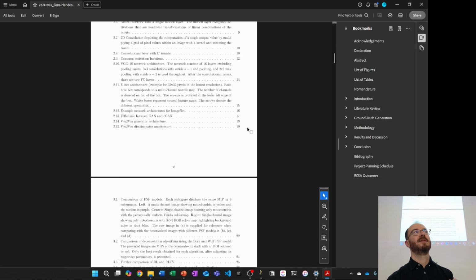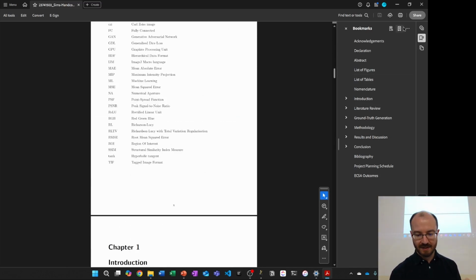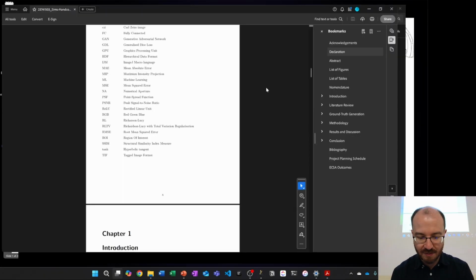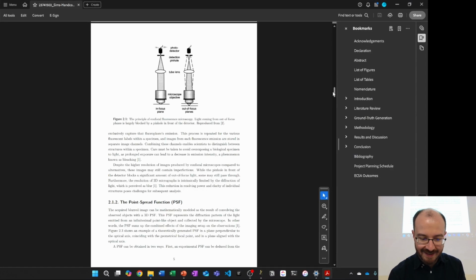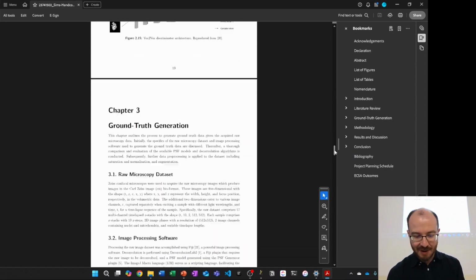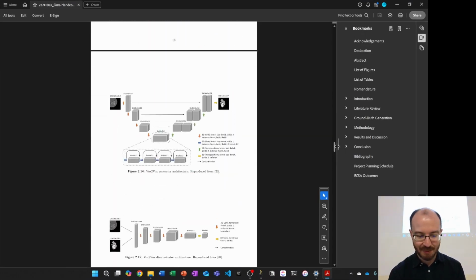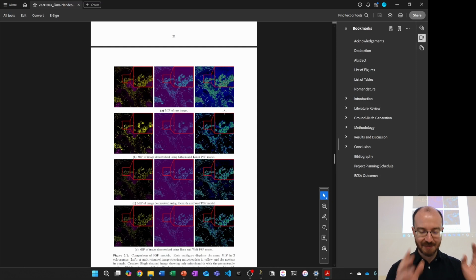The hope of a neural network is, neural networks are known as universal function approximators. So in principle, if there is a function from the input to the output, it can learn what that function is, and then it's a very quick input-output. It just does the math and gets the answer. But the big question here is, can we actually learn that mapping? I realize I'm not in the right paper to describe that, but this thesis will still be good for another discussion. But that's the context of the project.